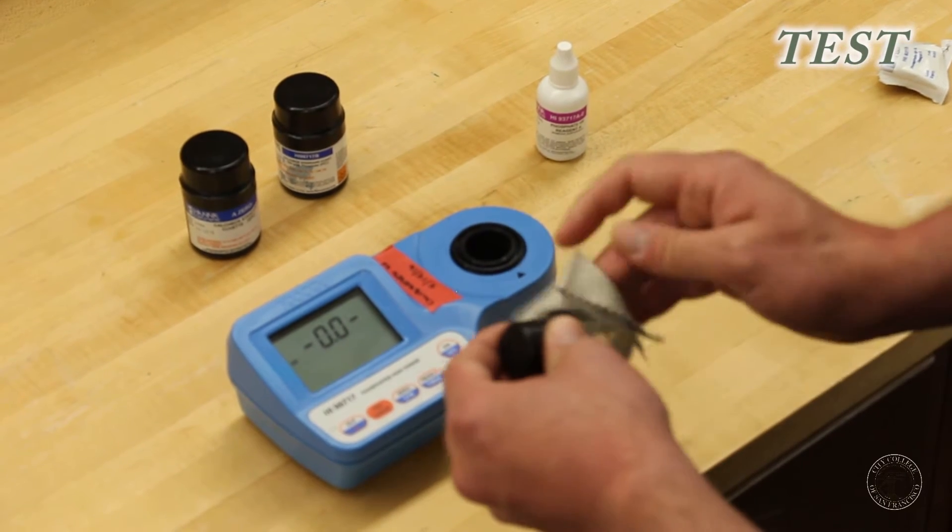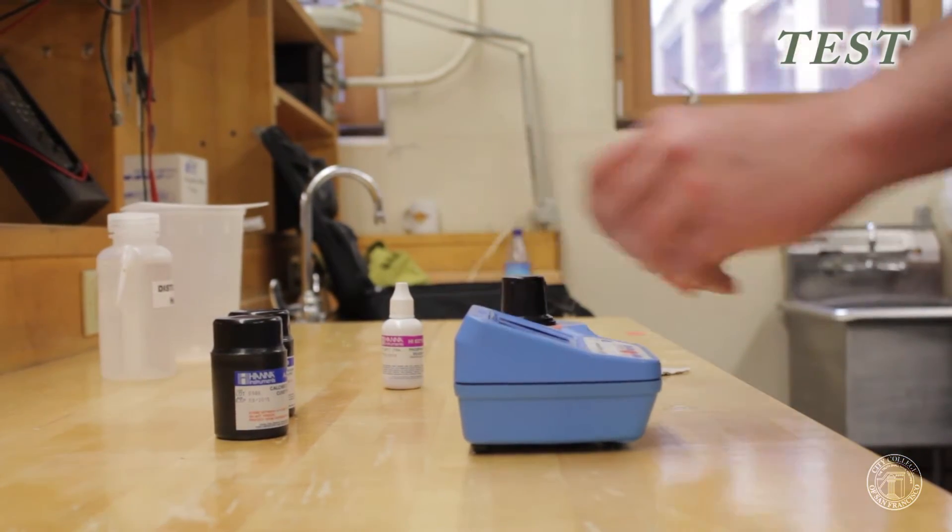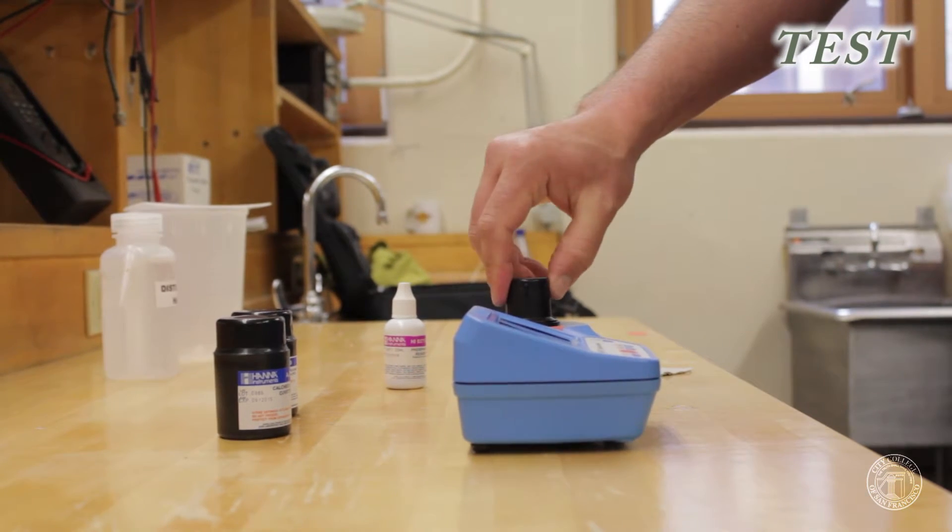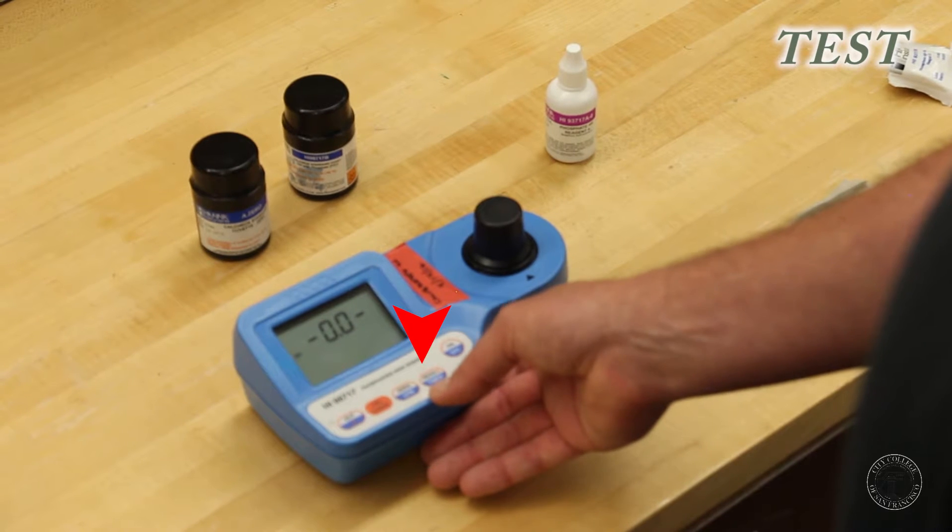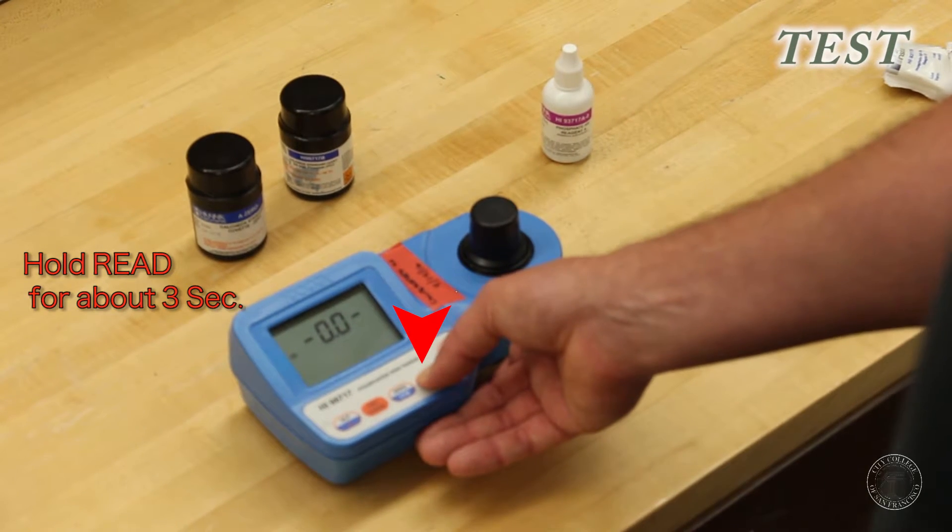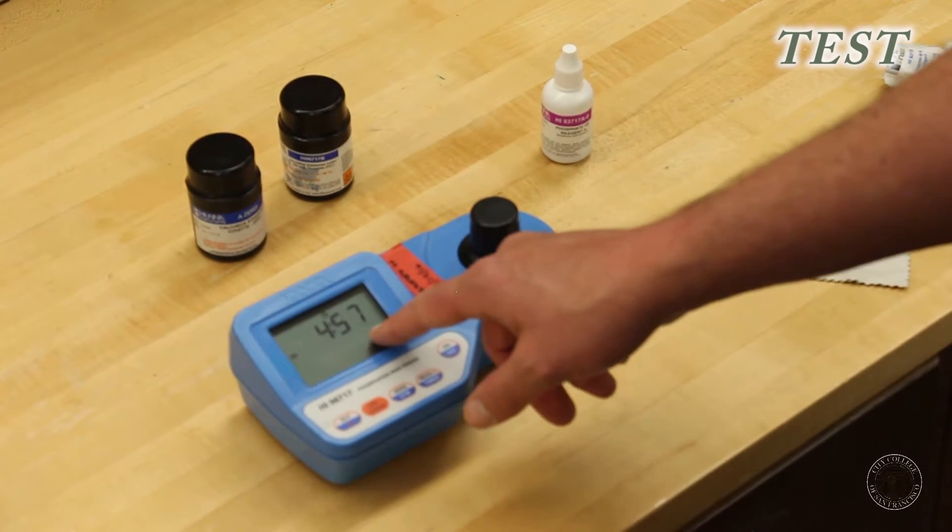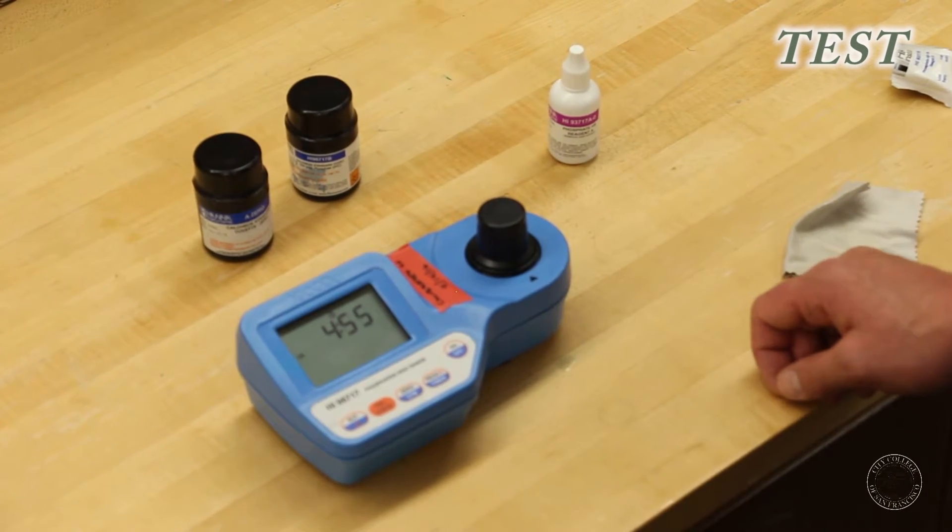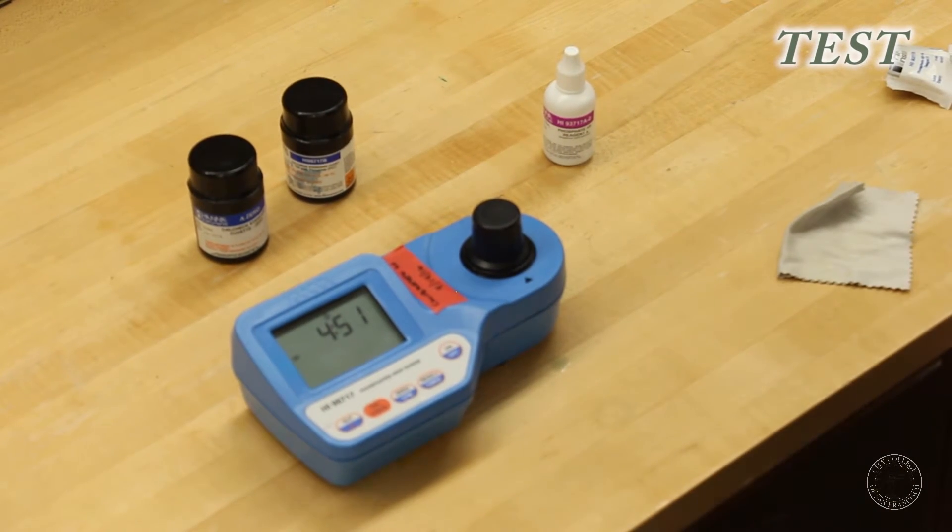We will wipe our cuvette and place it into the machine. Turn until the arrows are aligned. And then for this, taking a real reading, you want to hold the read for approximately three seconds. And then your read timer will come up. It needs five minutes to take a proper reading. And now we'll wait for the timer to reach the time of zero.